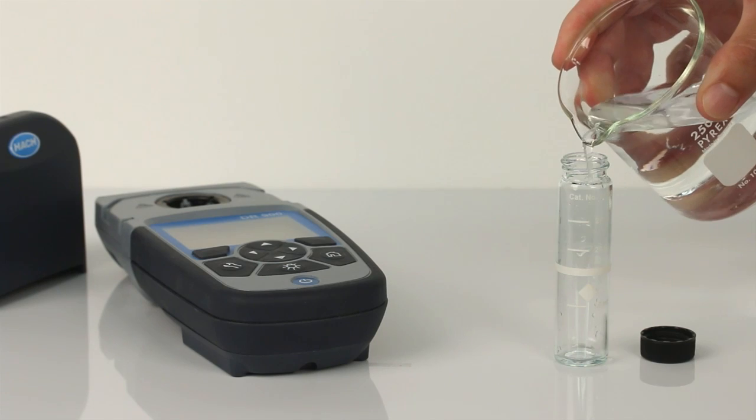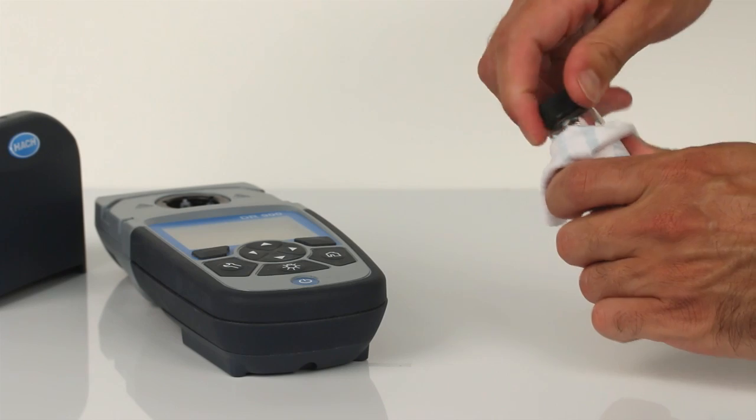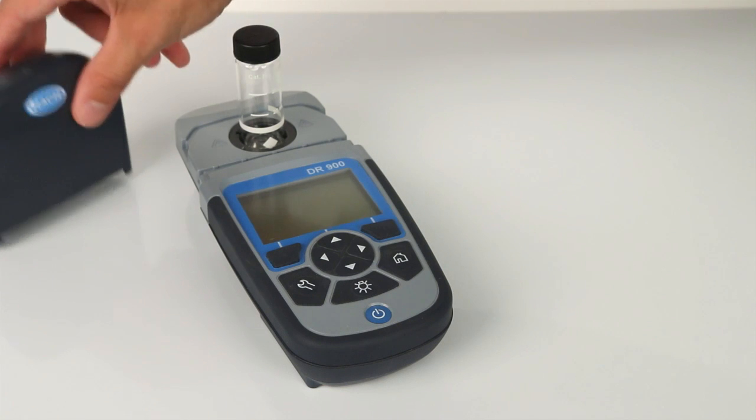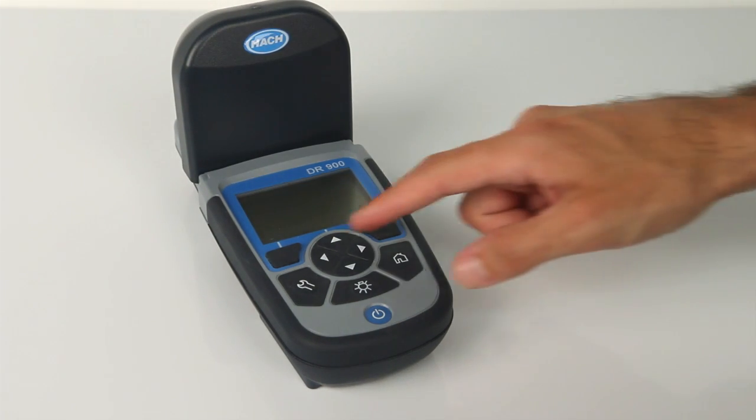Prepare your blank by filling a sample cell with 10 ml of sample. Clean the prepared sample cell and insert the blank into the cell holder. Make sure the diamond on the sample cell is facing toward you. Place the instrument cap over the sample cell, then press the zero button.